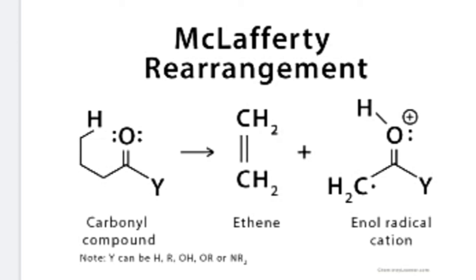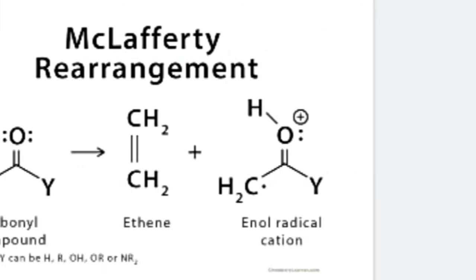So the carbonyl compound converts into an alkene plus an enol radical cation. This is called the McLafferty rearrangement.